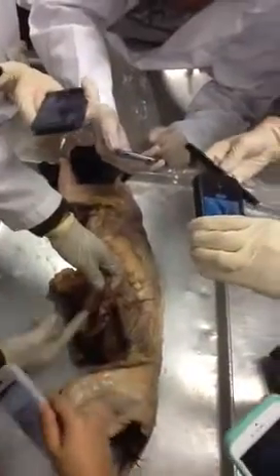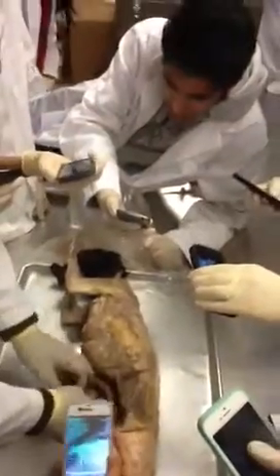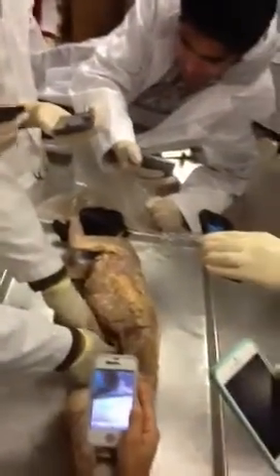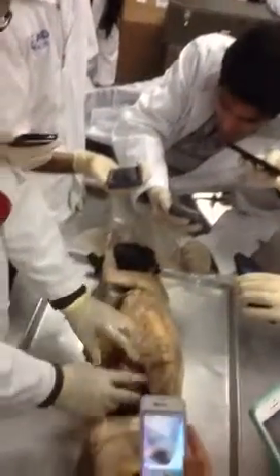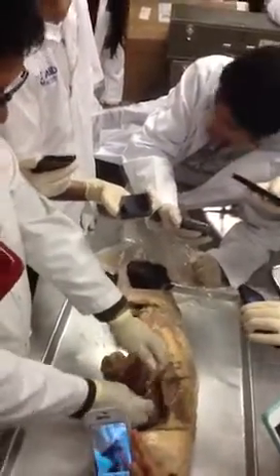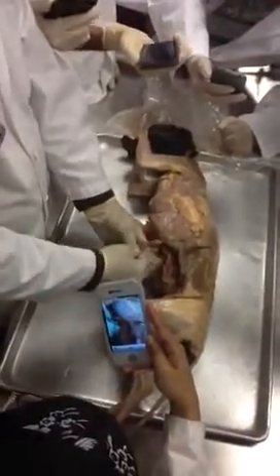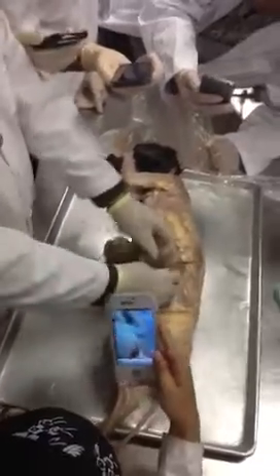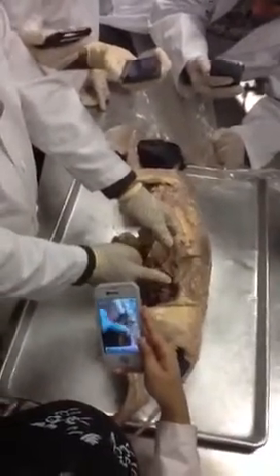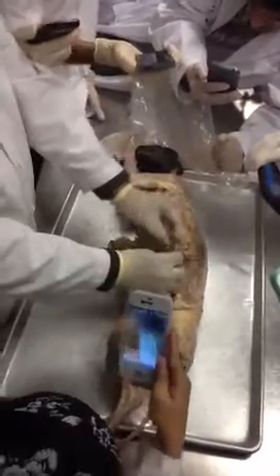Mesentery is also another fold of peritoneum, but it is not like the greater omentum. You can easily see that it is connected to the posterior abdominal wall, and then it is like flaring up, reaching almost everywhere in the small intestine, like a fan. It has got blood vessels, so it supports and holds the small intestine, so the small intestine doesn't get knotted. Plus, we need blood supply for the small intestine, right? So you can see the blood vessels.